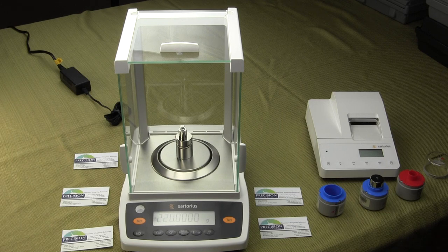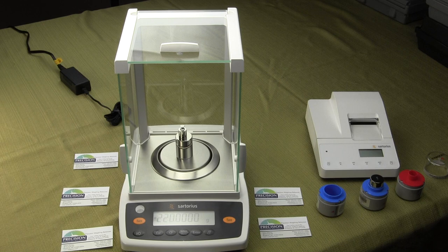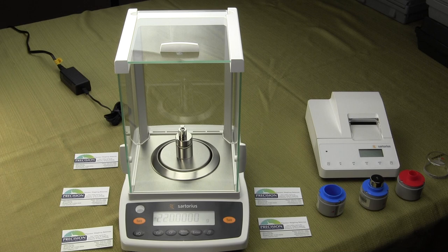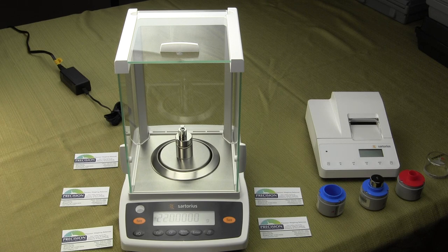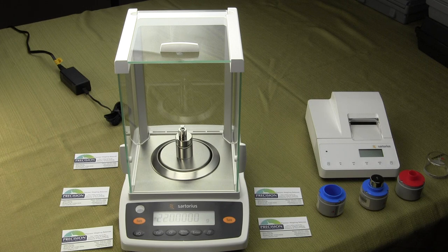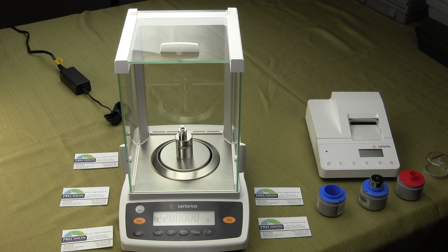The new series is RoHS compliant, which means they've taken a look at their PC board and replaced the lead content. RoHS compliance is required so they have very low levels of dangerous substances like lead, cadmium, mercury, and other chemicals. Sartorius had to do this in order to export the balance all over the world.